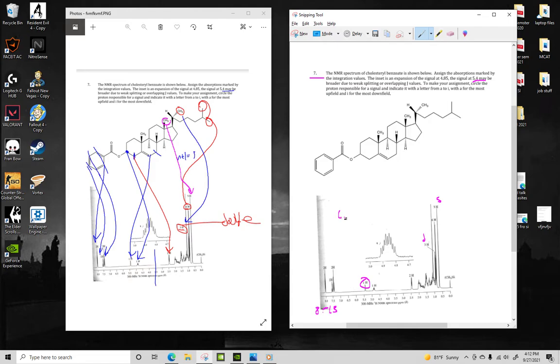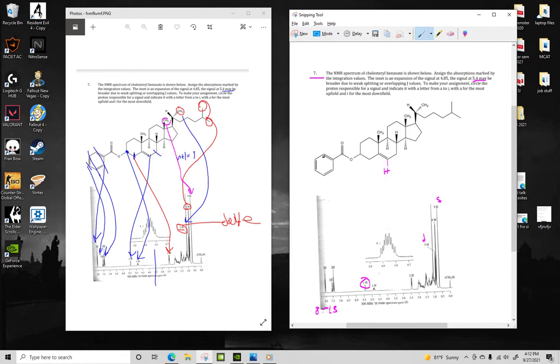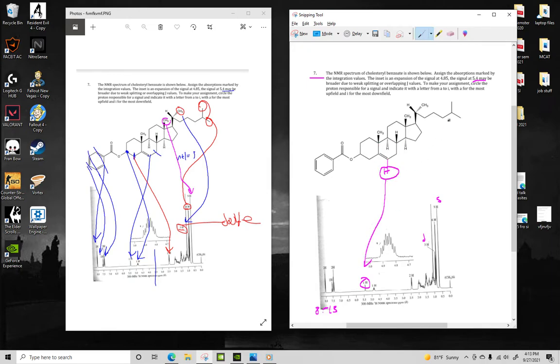At around 6.5 to around 4.5, you're going to have a vinylic hydrogen. That's going to be this hydrogen right here. That's the only vinylic hydrogen in the molecule other than the benzene ones. But these occur up here. So this hydrogen lines up with that peak.